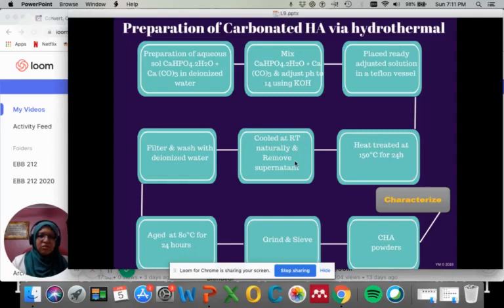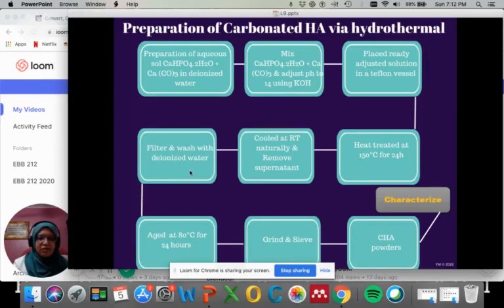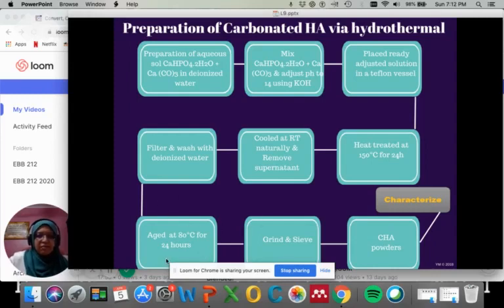Heat the autoclave at 150 degrees C for 24 hours, and normally we cool it down to room temperature naturally. The first thing to do when it's done is to remove the supernatant. When you use the autoclave, you'll see one layer of supernatant and another layer of sediment solution. Make sure you remove the supernatant before you start to filter and wash with deionized water. Then the filter cake needs to be dried at 80 degrees C for 24 hours. Finally, grind and sieve the dried cake to get the CHA powder, and then characterize it to confirm it is CHA powder.